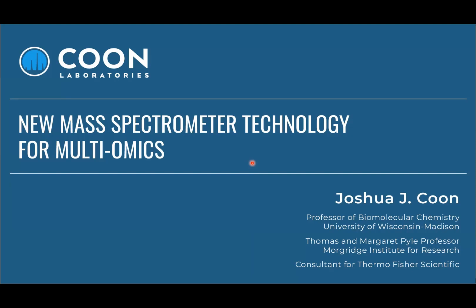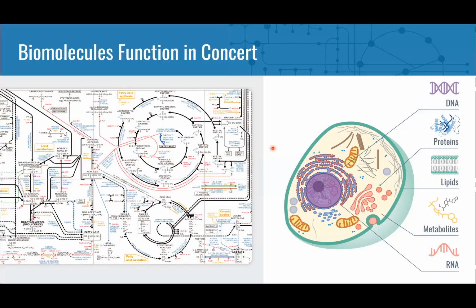To start, I would just like to call your attention to this pathway diagram, which I'm sure many of you are very familiar with. While my lab and many others have focused on proteins and proteomics over the last 20 years, I think it's increasingly appreciated that lipids and metabolites are also pretty important. If you can measure all of these molecules, you can more easily understand the system that you're working with. So today I'll show you a couple of examples where we apply these multi-omic strategies to learn some new fundamental biochemistry as well.